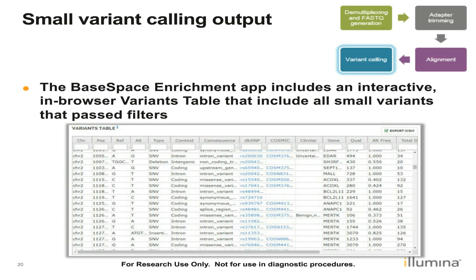And so if you want to, say, limit things to just chromosome 2, in that very first one on the top left, you would type in CHR2, and it would live update to filter just those variants found in that chromosome. Similarly, if you were looking for any variants found in a particular gene, you can enter that gene symbol in the gene column, and it will filter for variants that were found just within that gene. So it's a nice way to quickly look at things, narrow it down if you want to just take a quick look at your called variants.